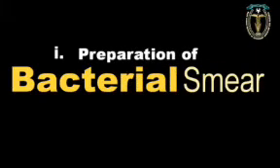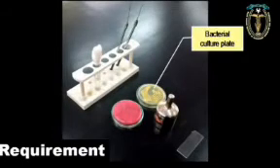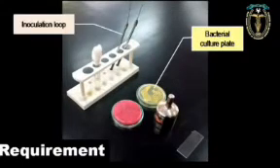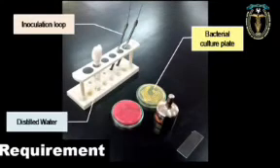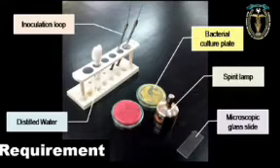Go to the next one. We have the preparation of the bacteria smear. The requirements are the bacteria culture plate, the inoculation loop, the distilled water, the spirit lamp, and the microscopic glass slide. Those are what we work with for this practical.